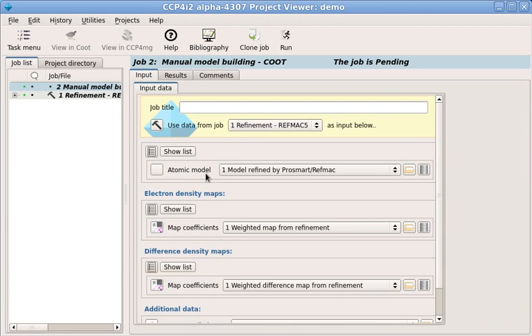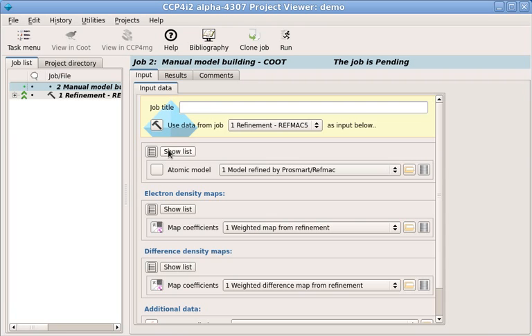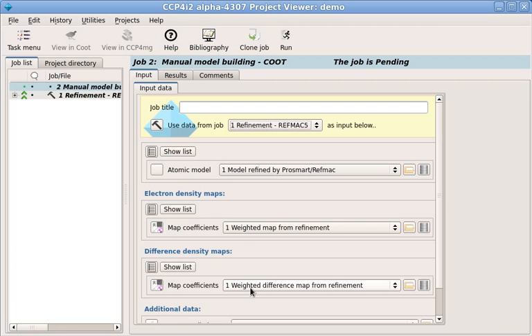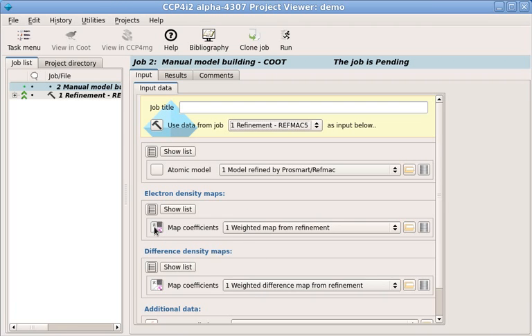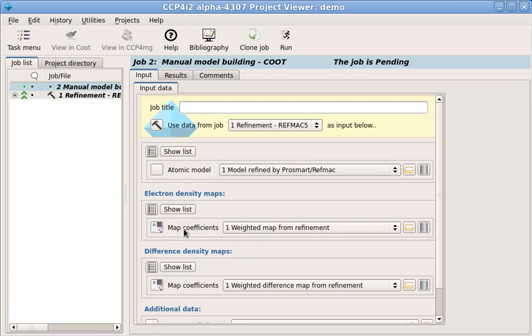Here's the manual model building window. When you open a new job, CCP4i2 can fill in the input data using data from a previous job. We can choose which job we start from using this menu or this icon. In this case, we're using the data from the refinement job as the starting point for model building. We can always look at the contents of a data object by right-clicking on the data object icon. These icons can also be dragged between jobs.